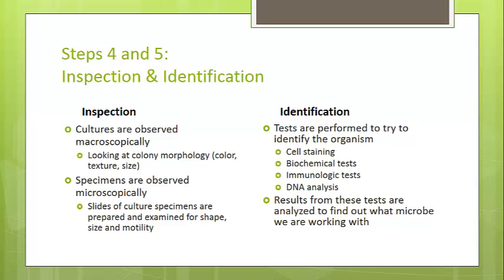We also want to look at those specimens microscopically. So we will prepare a culture, put it on a slide, and look at it. What does the cell look like? What shape is it? What size is it? Does it move? That type of thing. So we're looking at inspection.